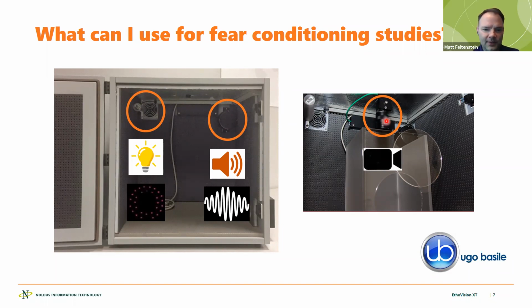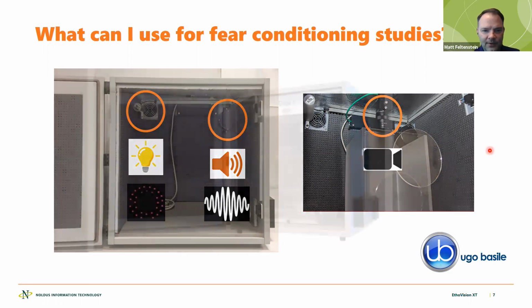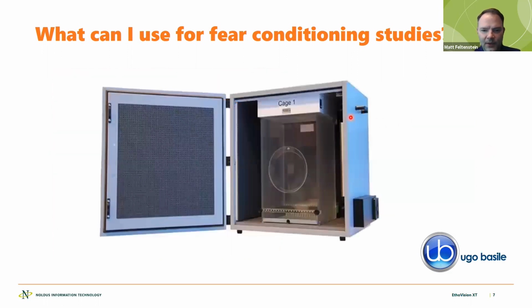Now, this is a really nice setup. It's the one I've seen, and it's my preferred setup. I'm glad that Noldus partners with Ugo Basile to make sure that this is going to work for you. One additional thing that Noldus has created, which I think is a really great addition: if you look at this image, this is the same kind of setup, but you see a white box that's mounted to the top of the sound attenuated cubicle. Noldus makes this addition and we insert it inside the Ugo Basile fear conditioning cubicle.